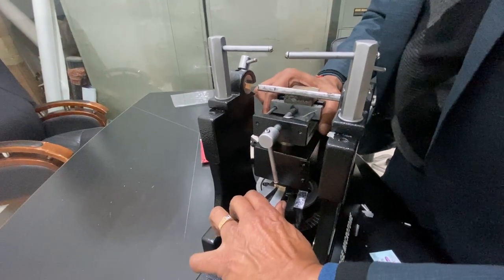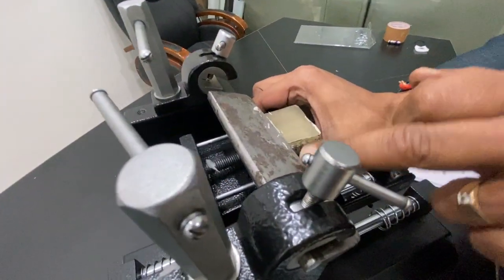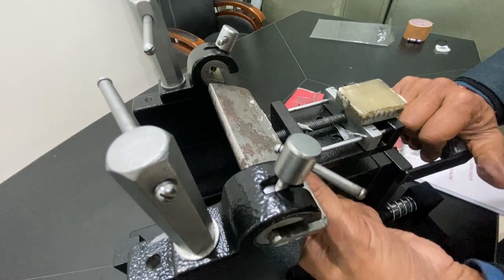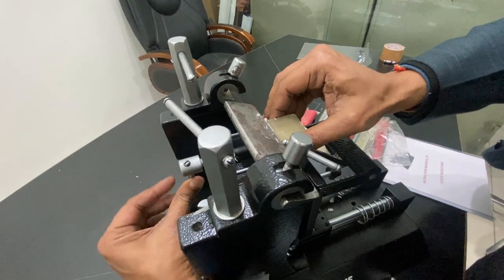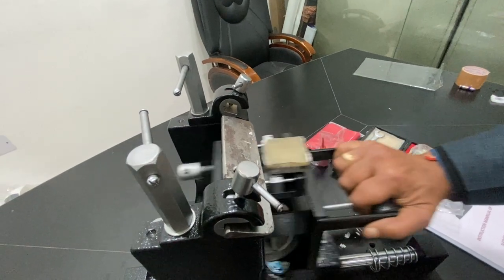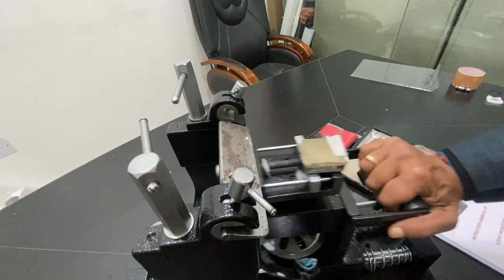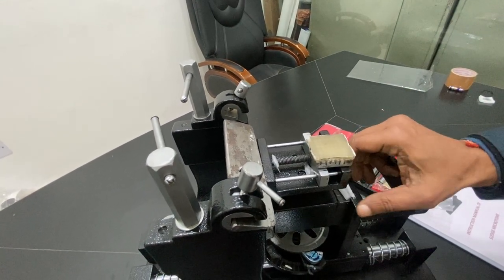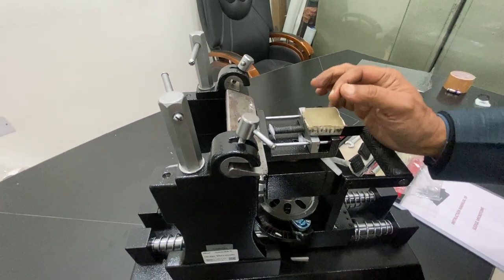Just see, I have brought it from this angle. It is touching the block, it is touching this section. So when it is touching, then only it can work properly. It should be tight, and then I can adjust once again this block tightening. Then once I do it, see, this sample is coming. This is only a sample block. These slices are coming. These are the sample cut by slices.